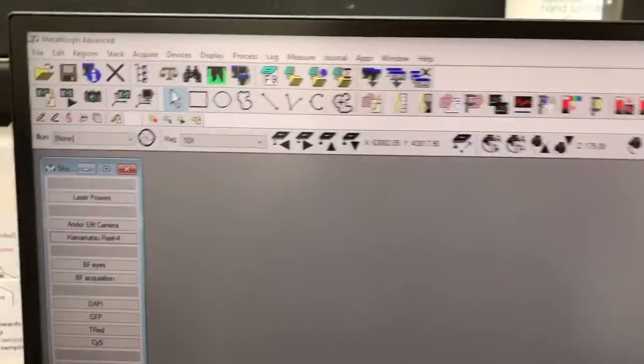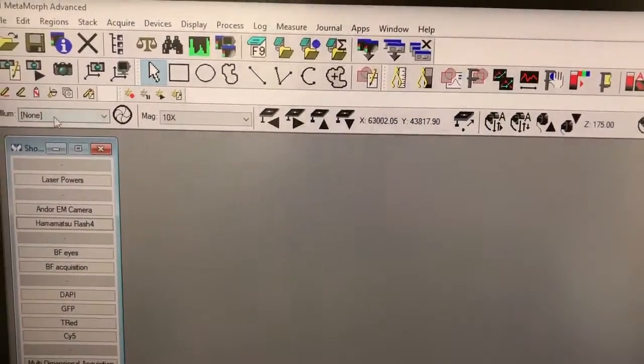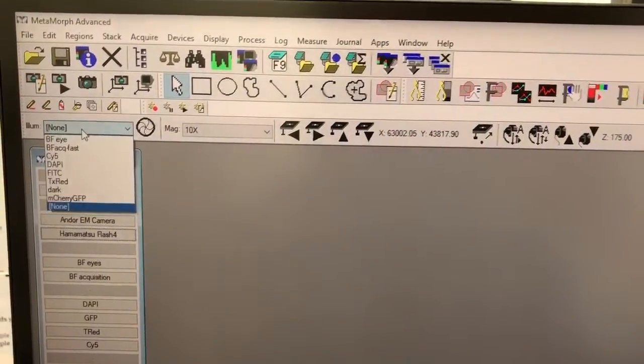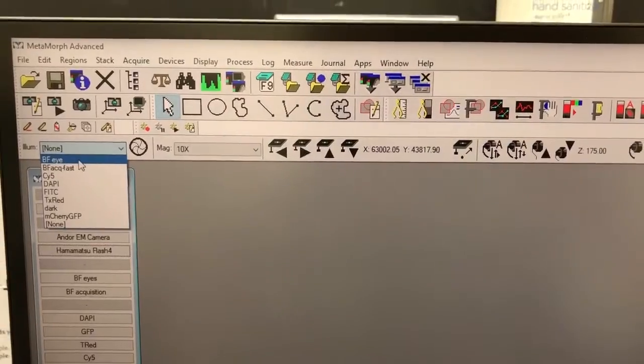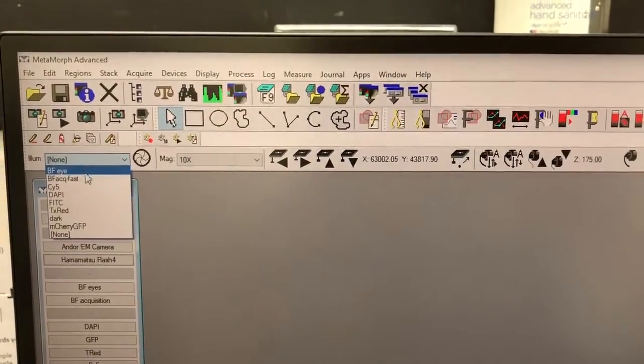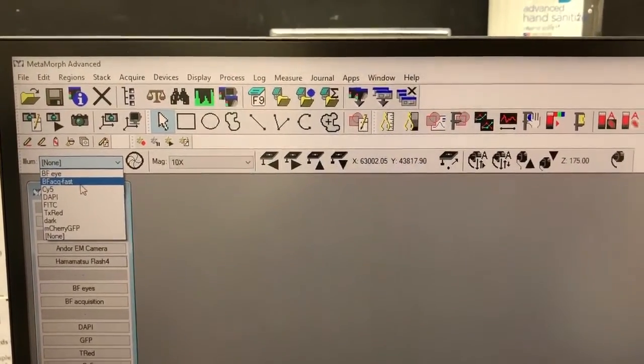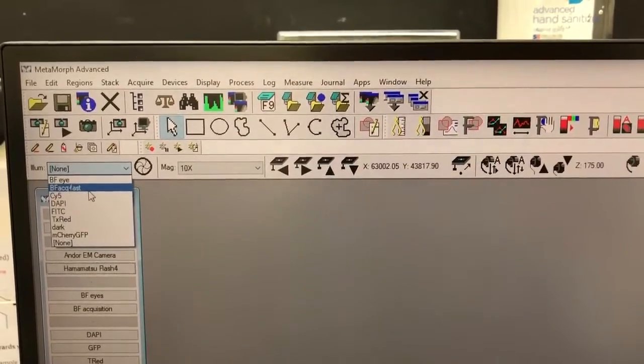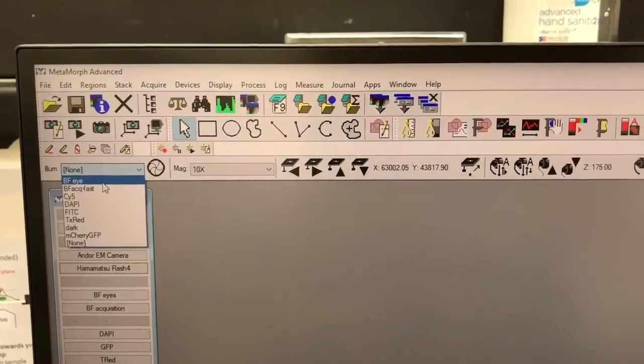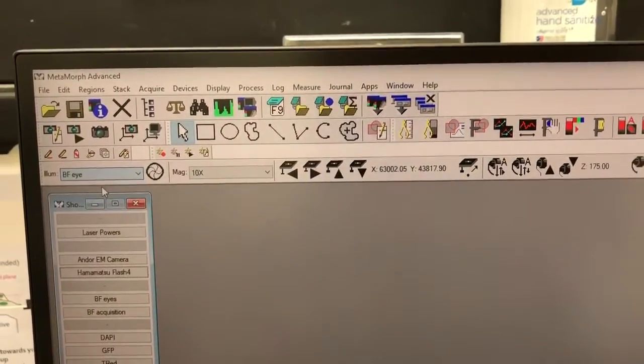So if we go here to Metamorph, if you look at the top left where it says illumination, you'll see that there is a setting called brightfield eye and a brightfield acquisition fast. Brightfield acquisition fast is what you will use with the camera. Brightfield eye, as it says, is for the eyes. So we're going to click that.